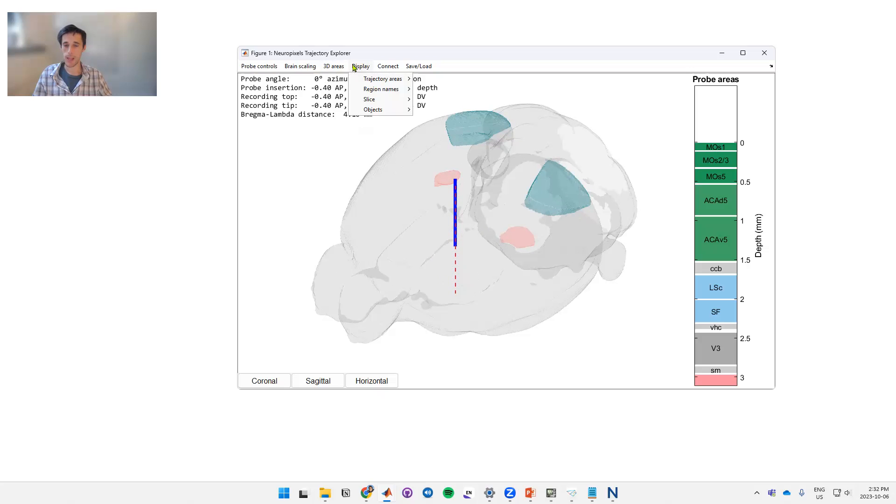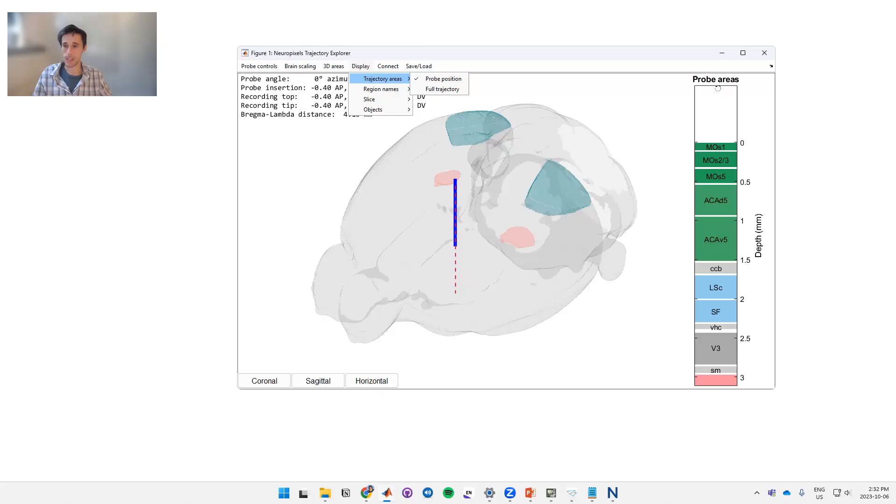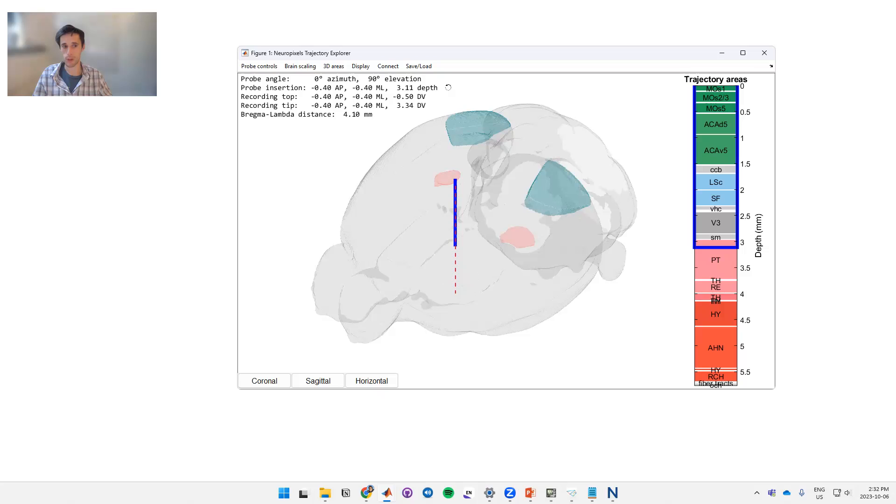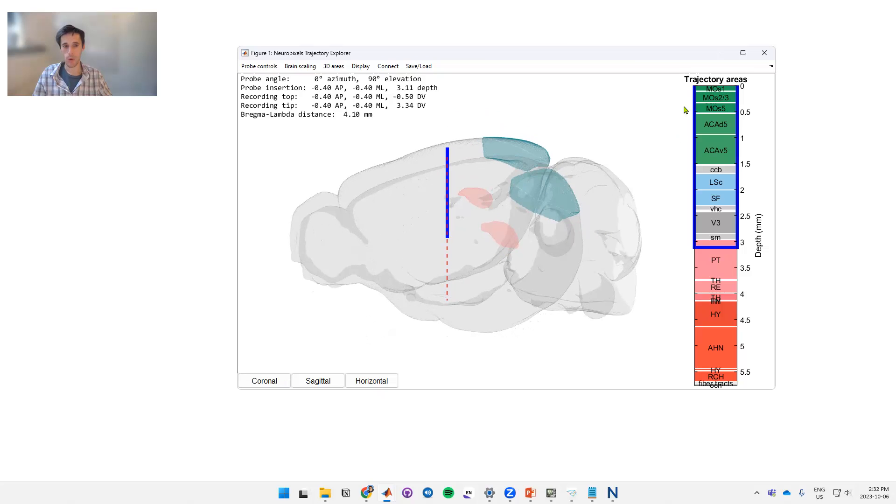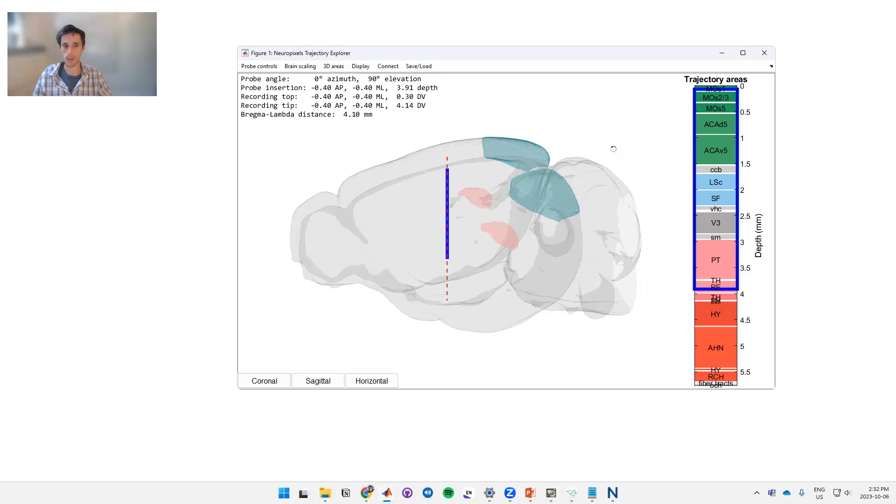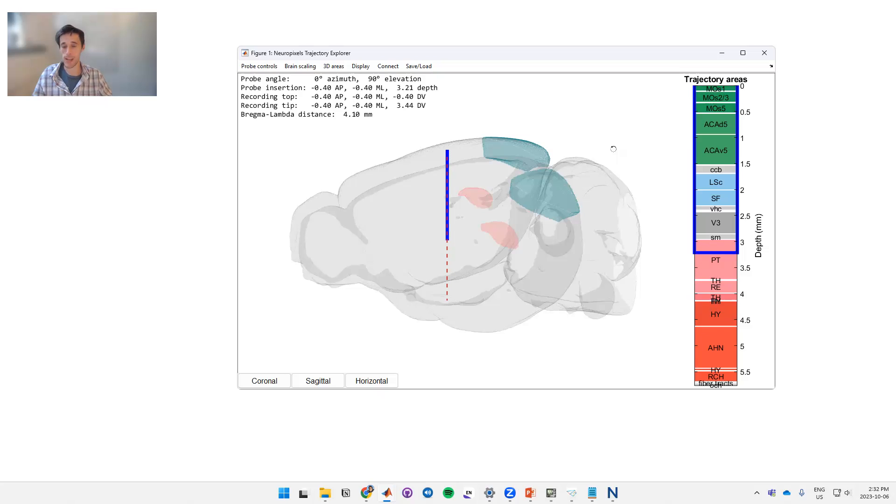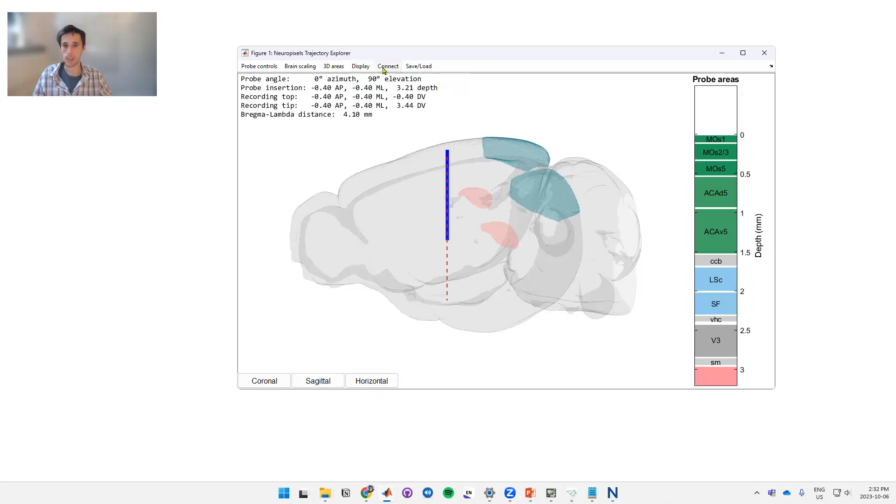Display here. On this first option, in this case what we're seeing in these probe areas on the right is where your probe is currently. If we want to see all the areas along the trajectory, we can go to trajectory areas and full trajectory. Now it's showing you where your probe is along this entire trajectory. So if we move the probe down we can see that this moves down. The point of this is to let you see what you're going to hit before you hit it.